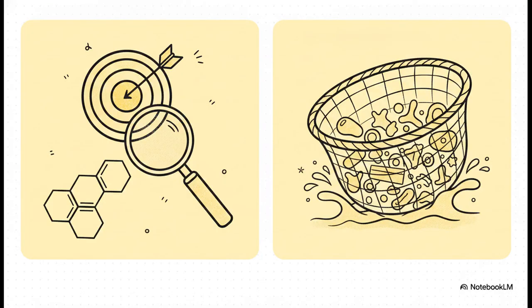So, what tools are we actually using for this translation? Let's contrast two of the real heavy hitters. First up, high-performance liquid chromatography, or HPLC. You can think of this as your sniper. It's highly specific. It separates compounds based on polarity so you can identify the exact target residues. Now sure, it's got higher costs and complexity, but it gives you the absolute strongest validation evidence out there.